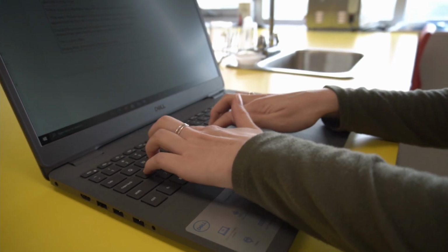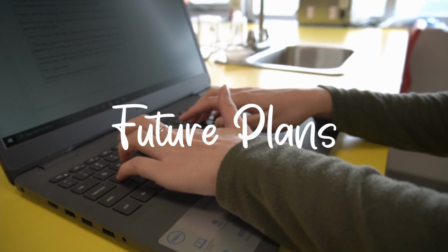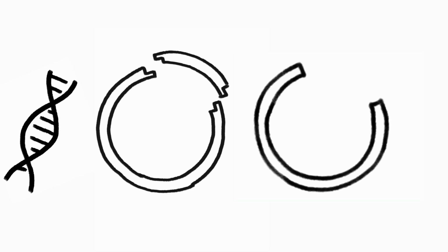Although we are still in the prototyping stages of our experiment, we have carefully constructed a detailed layout of our experimental design so we can further our research in the forthcoming months. We plan to construct a plasmid using the genome sequence of the GOX enzyme. We acquired a his-tagged sequence of GOX from an Israeli iGEM team that previously conducted independent research on it.